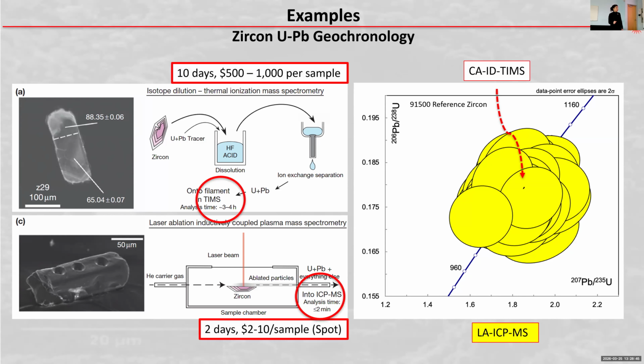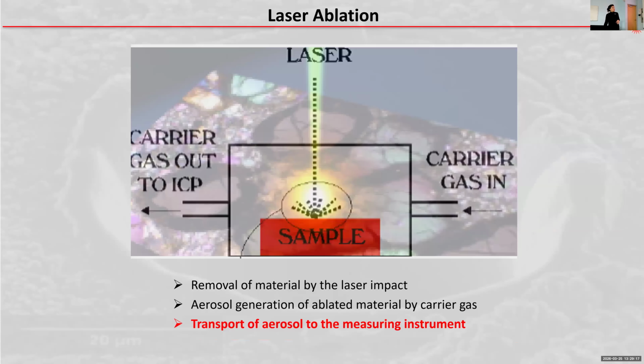However, having said that, to the laser's defense, the time and cost and the effort you put into these exact methods may compensate for the lack in uncertainty, or may not. It depends. What is certain is that laser ablation ICP-MS is a really, really great tool in combination with other methods, and it saves the thermal ionization mass spectrometer a lot of time and money if you screen your samples beforehand with the laser ICP-MS method.